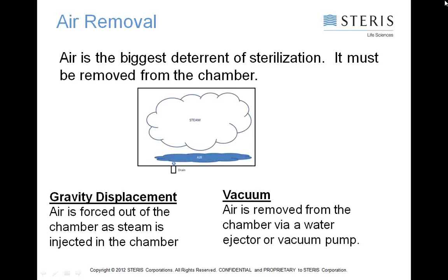Now, up to this point, these first four that we've talked about, time and temperature, steam contact, and air removal, we have some control over, either through the way we set the sterilization cycle parameters of time and temperature. Usually those are configurable on your machine. And of course, we have some control as we look at our load and analyze it for making sure it's not too dense, not too overpacked, that we don't have glassware sitting upright and creating an air pocket to trap air, for just, say, using a gravity cycle.